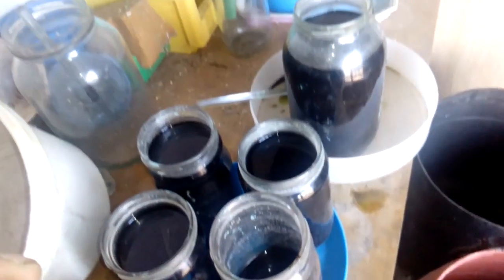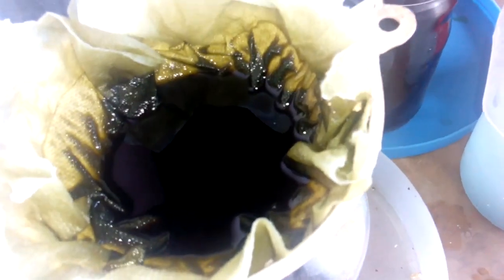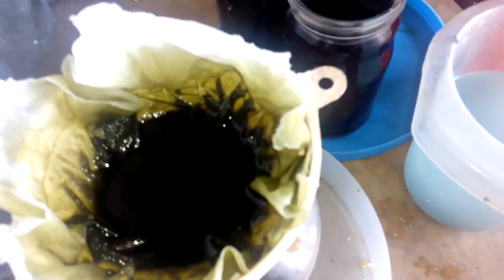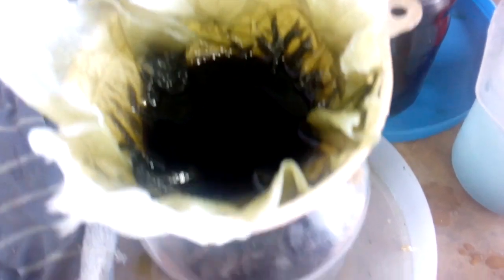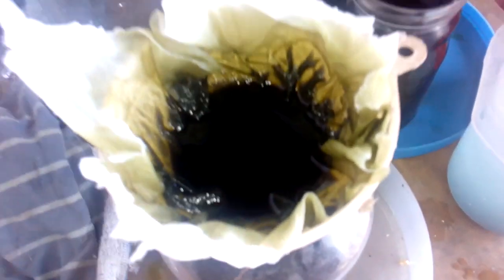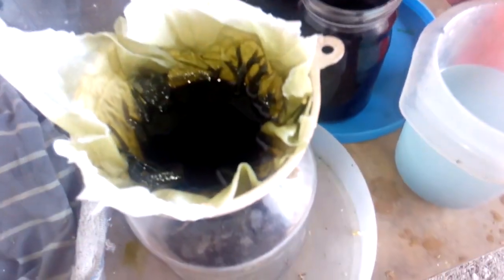Now it's time to filter and collect all the silver dust and melt it. I'm starting the filtration slowly. I use a charming plug and some paper tissue over the plug to catch every single piece of silver. I will filter everything through the same filter to collect all the silver in one filter, and then we will melt it to see how much silver we got.